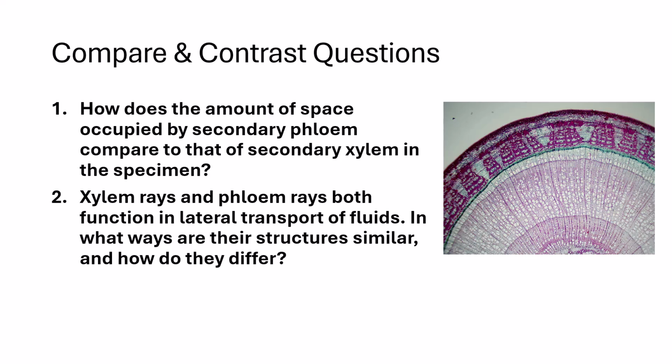Answer these compare and contrast questions. How does the amount of space occupied by secondary phloem compare to that of secondary xylem in the specimen? Think about proportion and function. What tissue makes up most of the stem, and why might that make sense for support and transport?